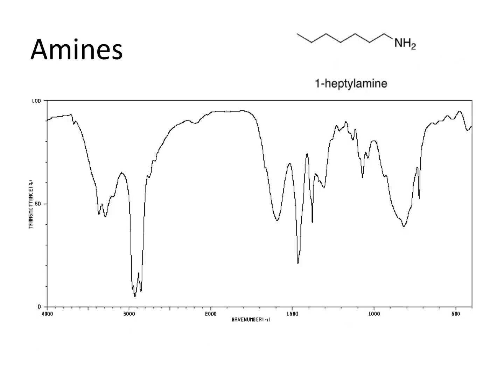All right, so now I'll show you another type of functional group. So another one's called an amine. An amine means it has nitrogen bonded to carbon with single bonds, and there's no double bonds around it. So that's an amine over here on the right. That's heptylamine. So the peak that you're looking for, if you look on the chart, it says it's also above 3,000 like the alcohol. But if we look at that region, you notice it's this peak here, right? That looks different from the alcohol. How is it different? It's a different shape, right? So it's not a different place, but it's a different shape.